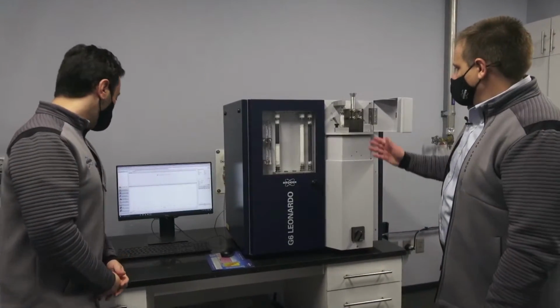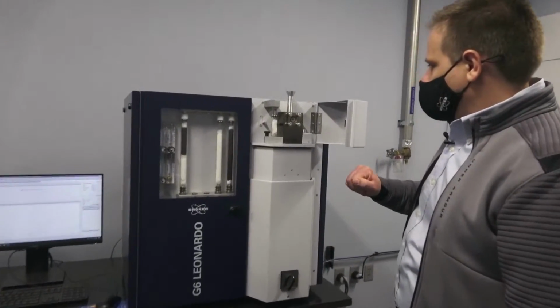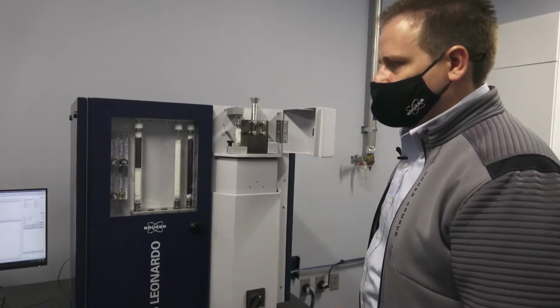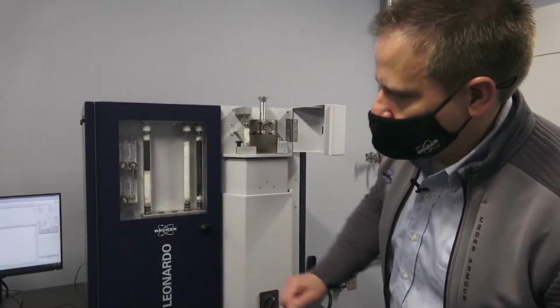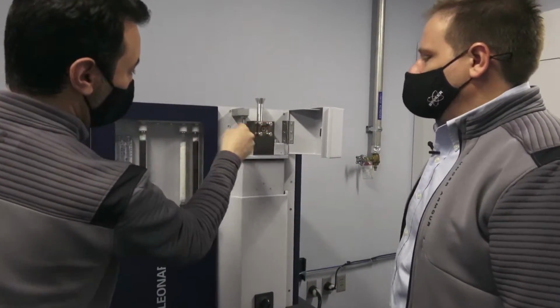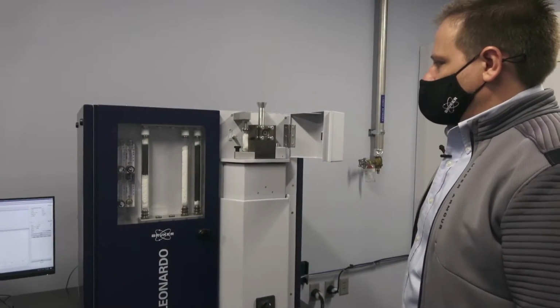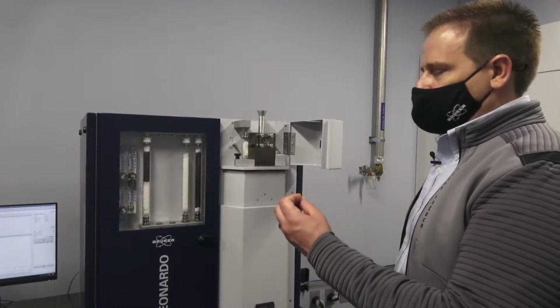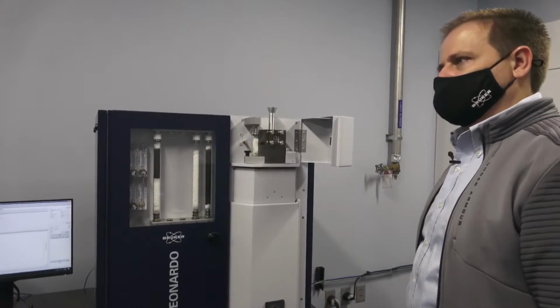I can actually see some light going on in there. Yeah, if you're seeing light, it means that it's already hot and glowing. We're getting ready to see a twist, and you will see the sample rotate and drop into the hot crucible. In a few seconds we should be able to see the peaks. And in this case, what was the sample? It looked like a little metal chunk. It's a small steel sample.